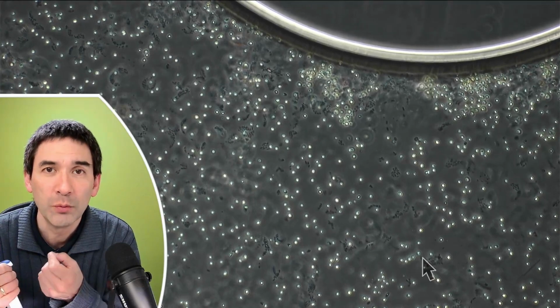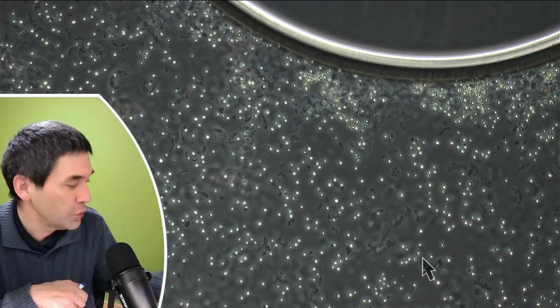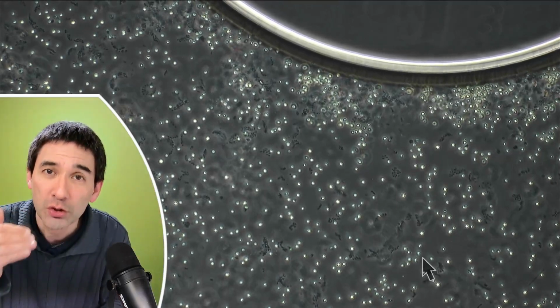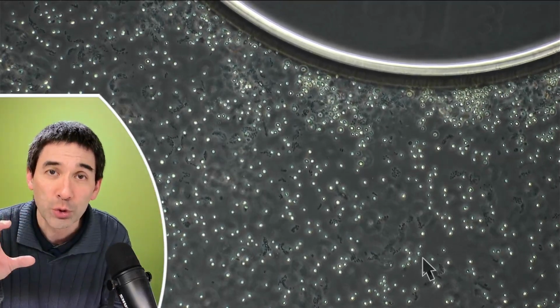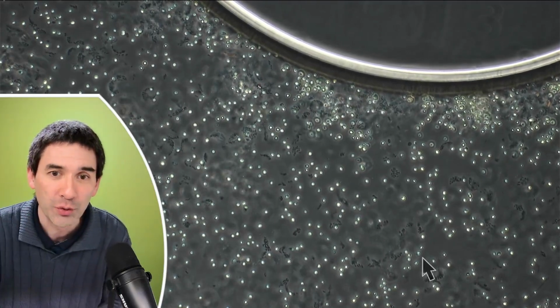And one way would be that you simply take a pipette and you add a little bit more liquid, or you take some tissue paper and you remove some of the liquid, and this causes a certain directional movement and a streaming motion, and then you have the random Brownian motion superimposed on that. So I want to show this to you.